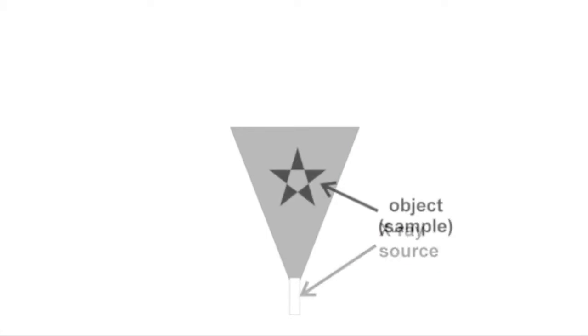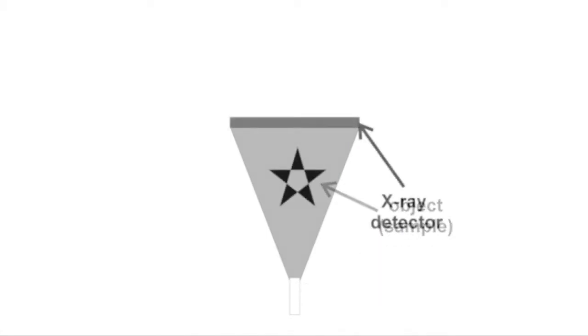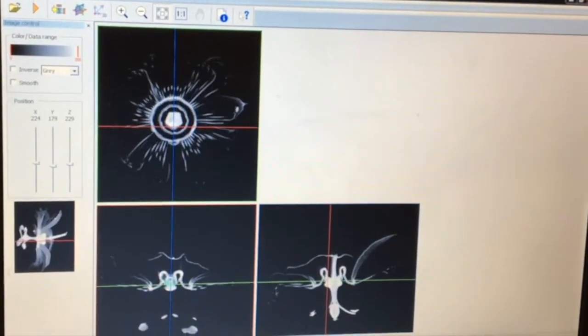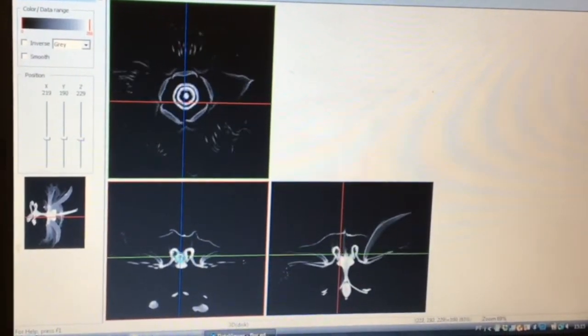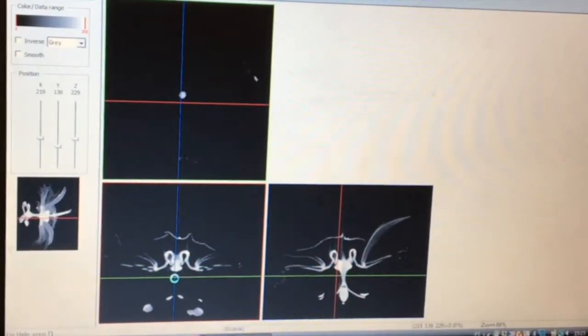A source of X-ray illuminates an object, and a detector captures an image. Hundreds of images are acquired while the object rotates. These images are used by a computer program to reconstruct a stack of virtual cross-section slices through the object. These slices can be obtained in many different orientations to provide the information needed.